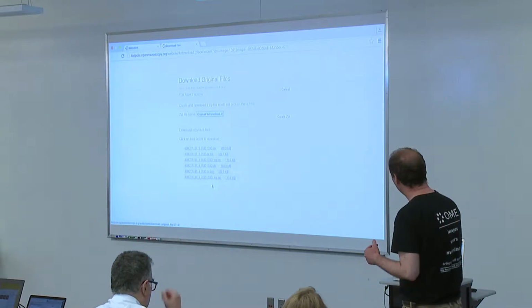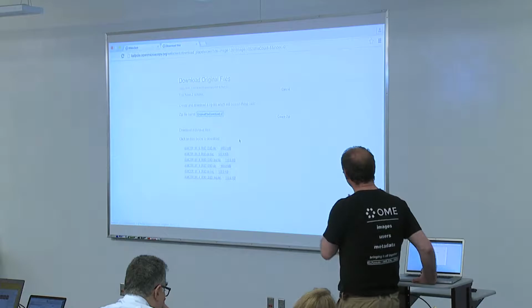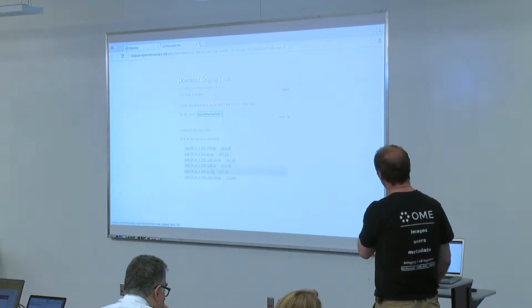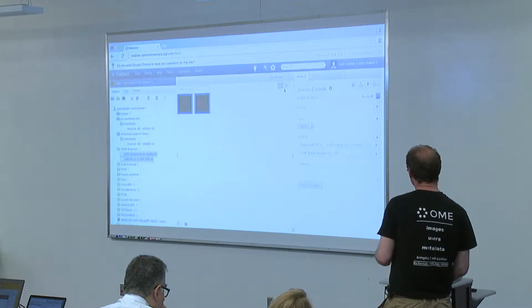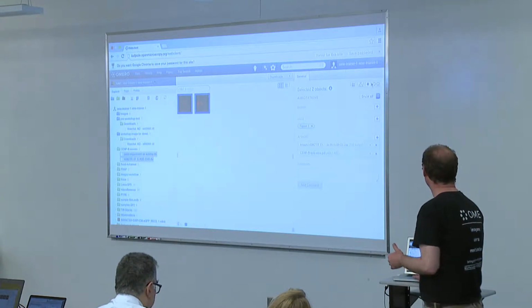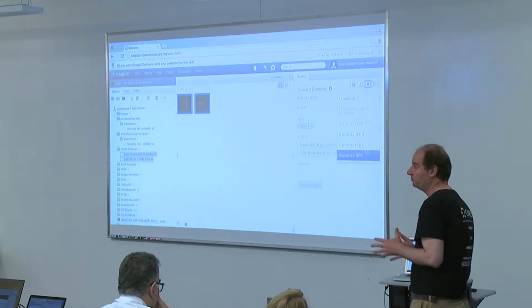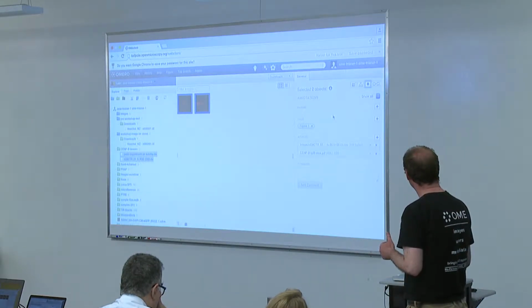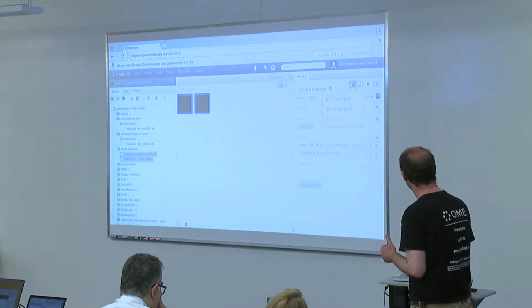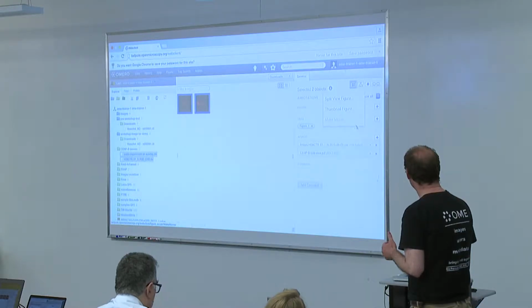Obviously these two images are complex, and there are a couple of files behind them. So you can download them singly, or you can make a zip. So I think that's a very important feature. You can also export the data as JPEG, PNG, or TIFF. This would, of course, not be the original data. This is this button here, but there are these capabilities. And I was already mentioning the creating of small figures.